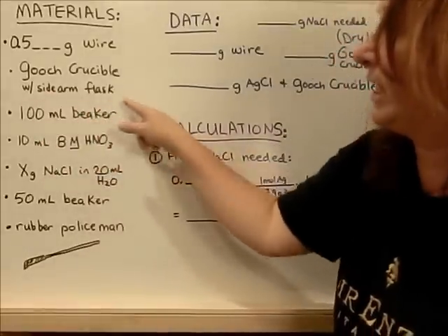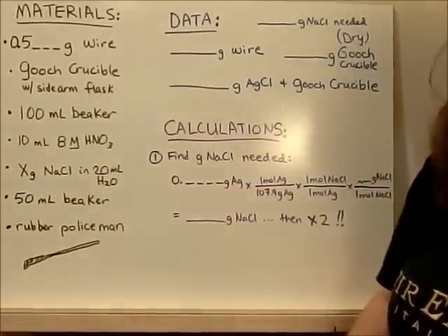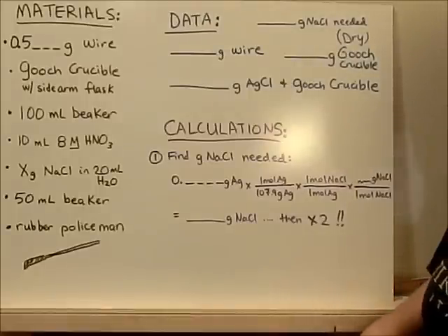You will need a Gooch crucible with a sidearm flask, a beaker. This will be the main reaction beaker that you put the wire and the nitric acid in. You'll need 10 mils of this. I'll have that at the hood, so you don't need to get a 10 mil graduate.